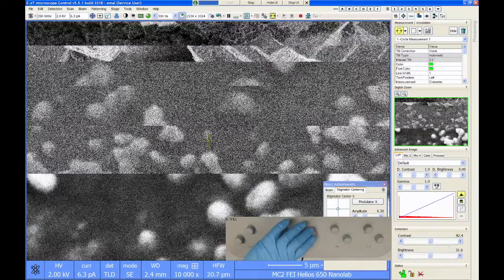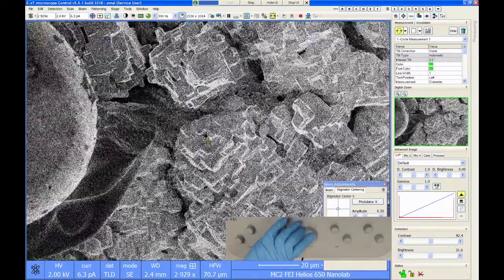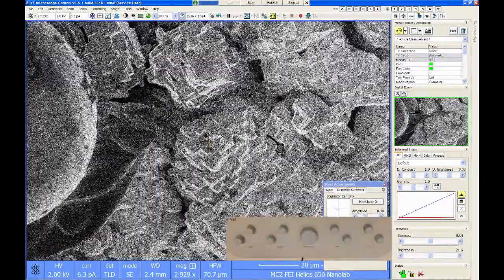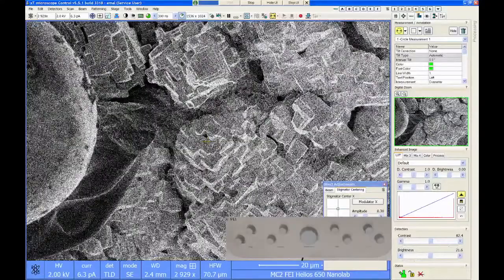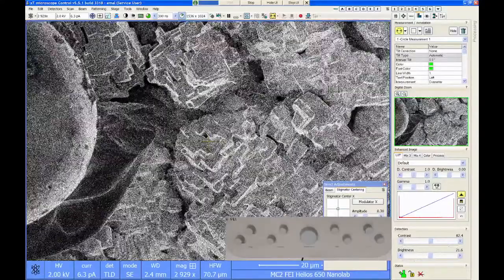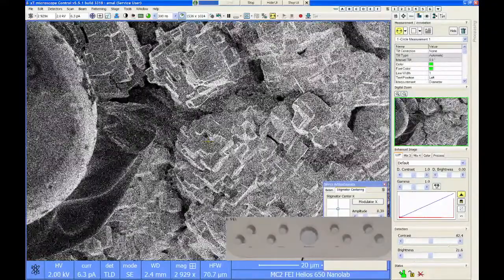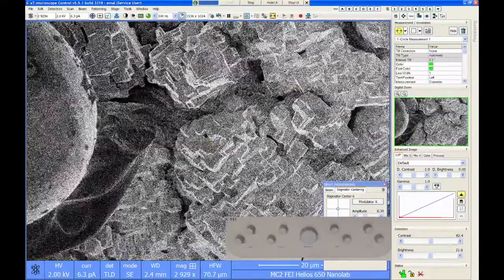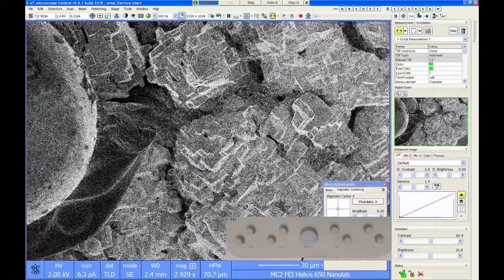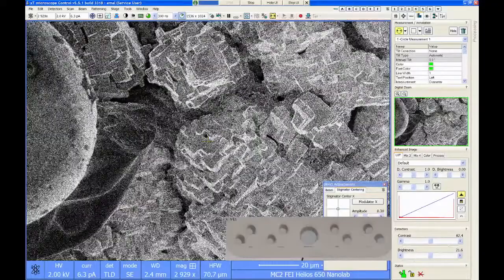Okay, and I've done a lot of TEM before, but let's say I had like a silicon wafer or a silicon chip, like a small piece, and I grew a bunch of these like nanoparticles on there. I could do that in TEM too, right? That would be a little trickier to set up because if the particles were on a solid surface, you have to get them onto some kind of a transparent film. Right. So I think that's why I was asking about if I could do it on this.